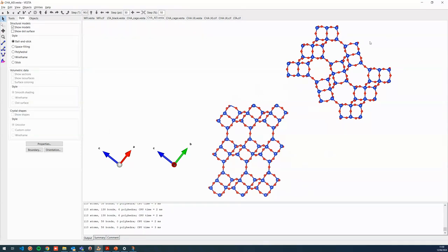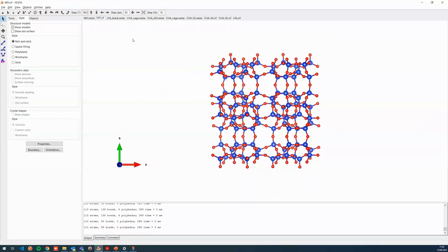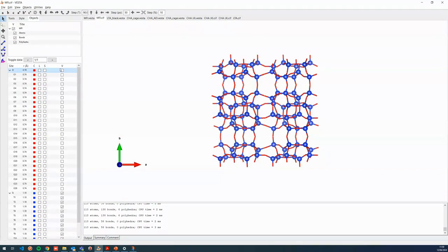This is also, I created 2 faces, put them next to each other, and I didn't even look into the appearance. I just made them in a nice orientation like this. Last thing maybe I want to show is how would you make this zeolite figure like such. Again, once you have the tools, once you understand how this works, this goes very fast. What I did here is the quick and dirty technique for clarity, and I connected all the T atoms. So I will do this over here as well.